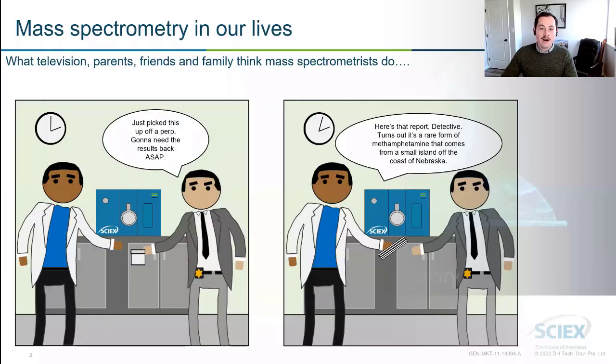If we take off our science hat for a moment and think about how the general public interacts with and views mass spectrometry, friends and family might be familiar with it from something like a TV show. In fact, if you have told anyone you're a chemist within the last 7 years, they probably responded with, oh, like Breaking Bad. And that's fair. They did use mass spectrometry in Breaking Bad to test the purity of methamphetamine.